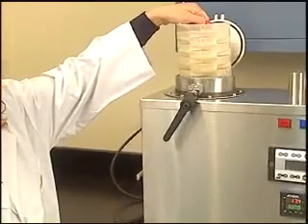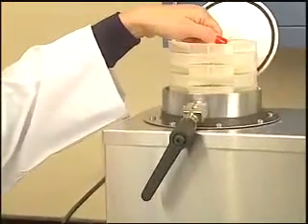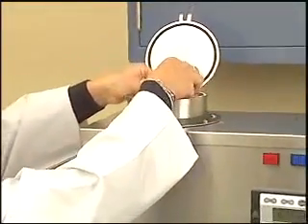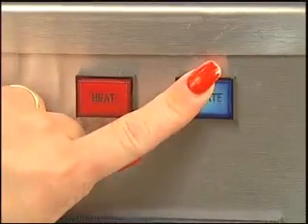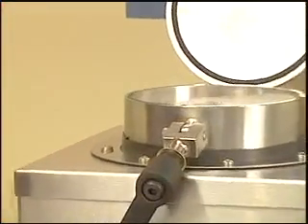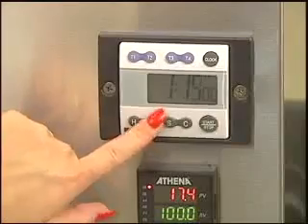The bag suspender, complete with samples, is slowly lowered into the vessel and a small weight is added to balance the agitation process. With the samples in place, the user pushes the agitate button and confirms the movement of the bag suspender before closing the lid, setting the timer and pushing the heat button.